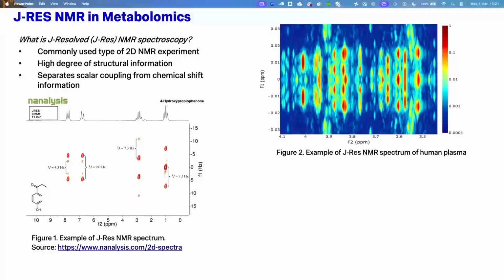When we look at a complex mixture such as human blood or urine or something like that, we get a mess, okay? So this is now, if you like, the sum of lots of these different molecules all added together at different weights. So we've got lots of different peaks all over the place, many of which overlap with each other, okay? And that's the key point, that it's a very, very crowded spectrum. What we'd really like to do is improve the resolution of that.